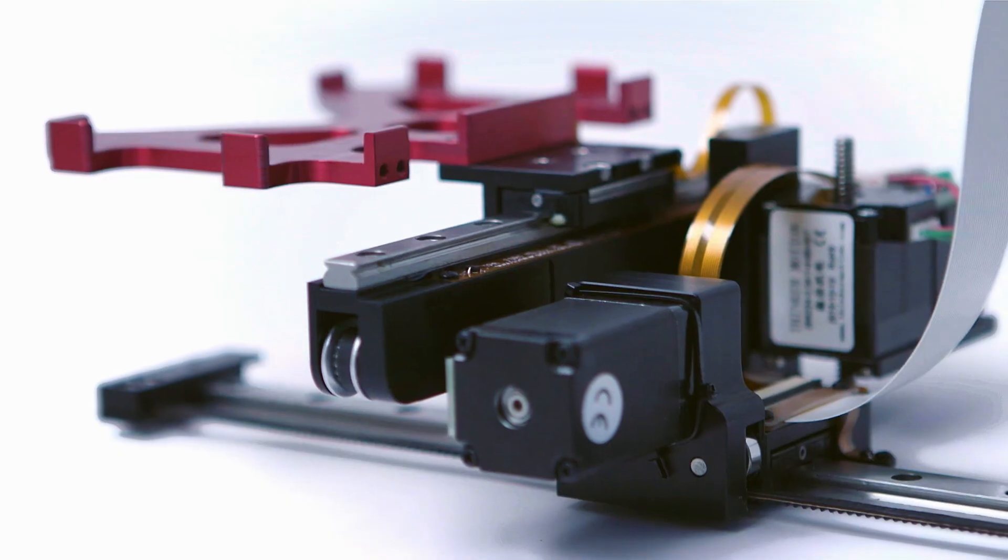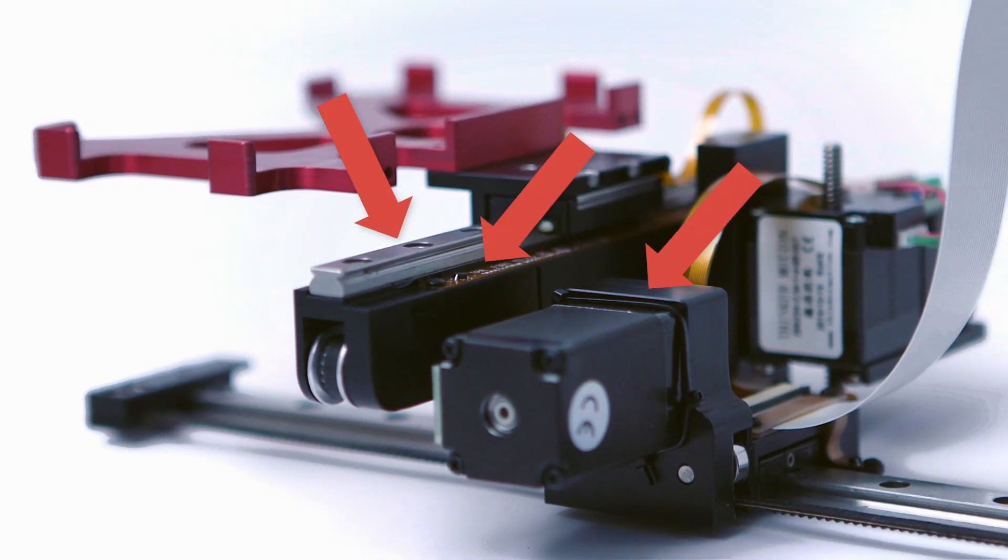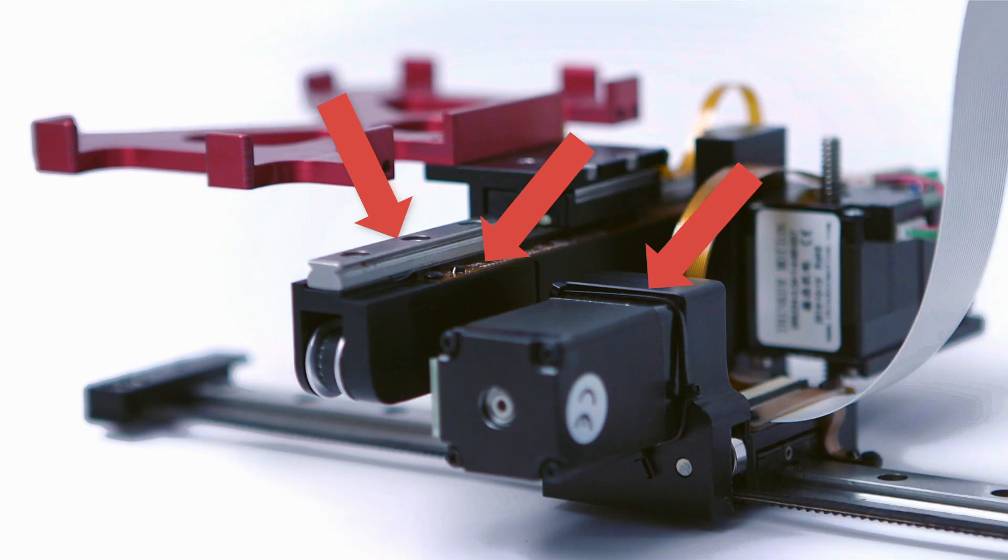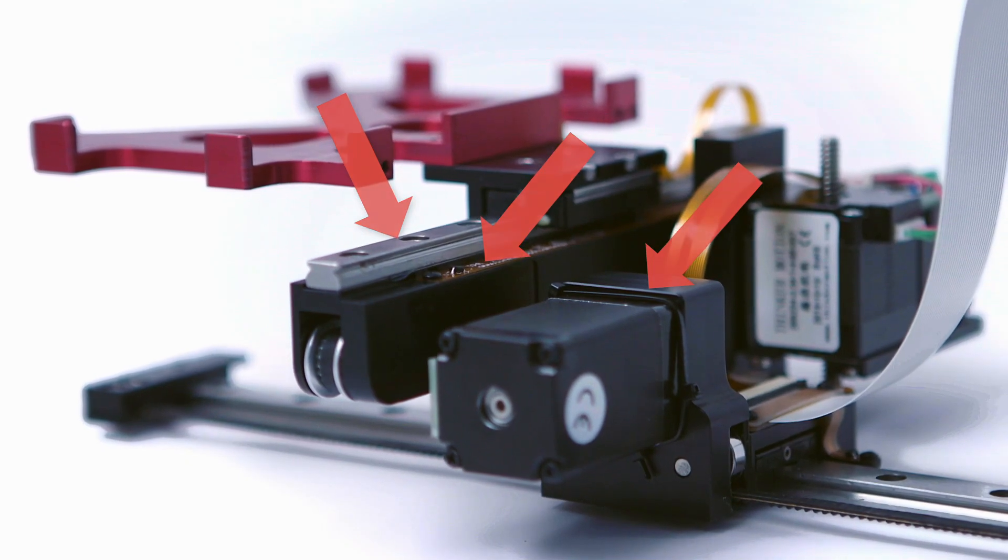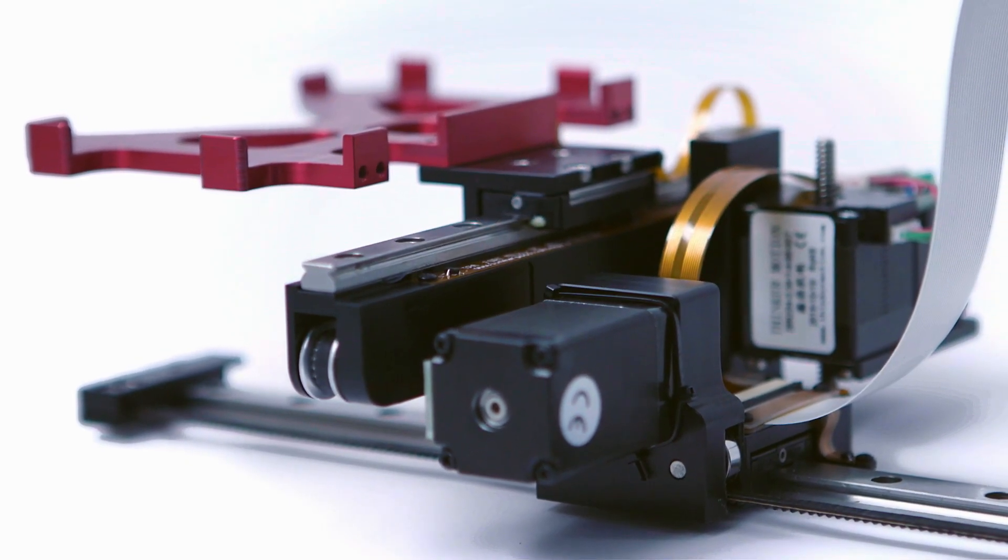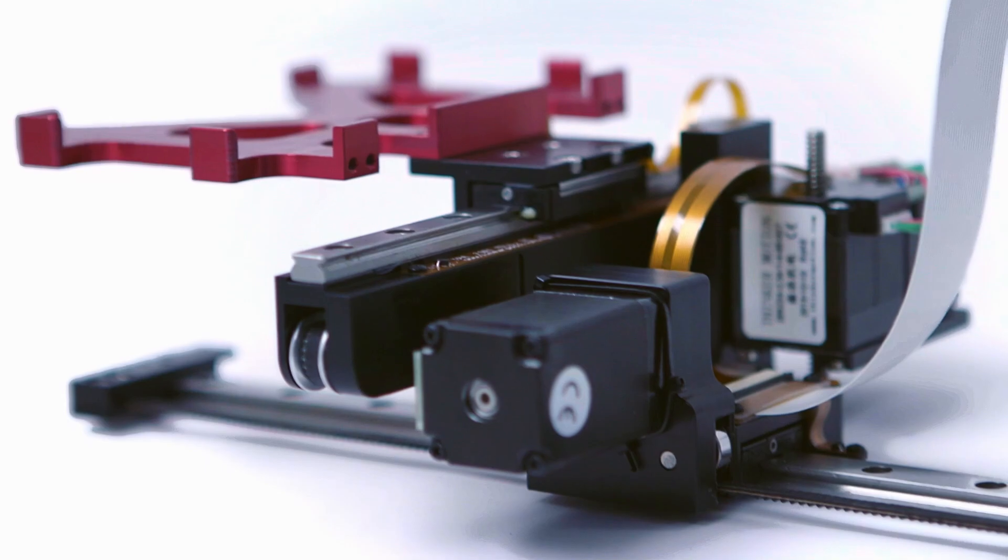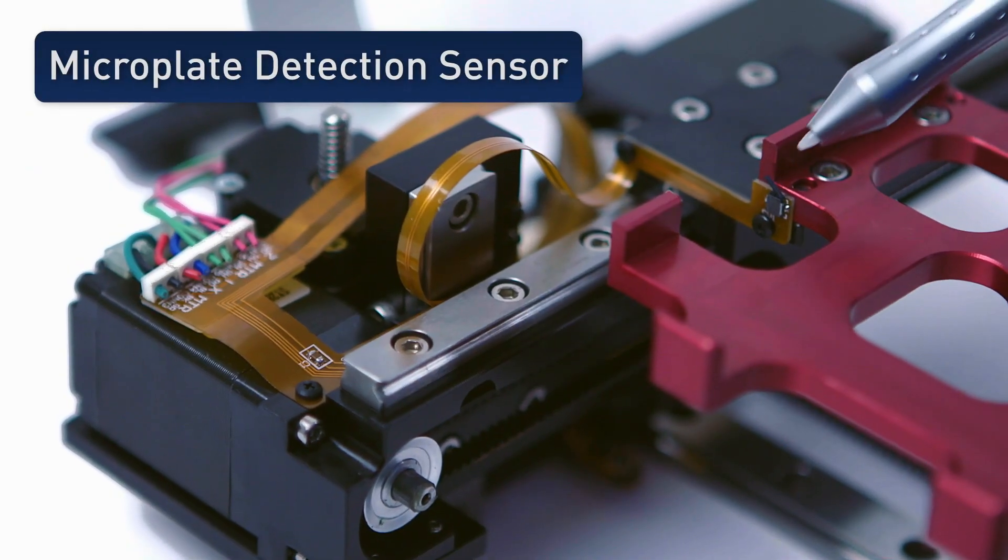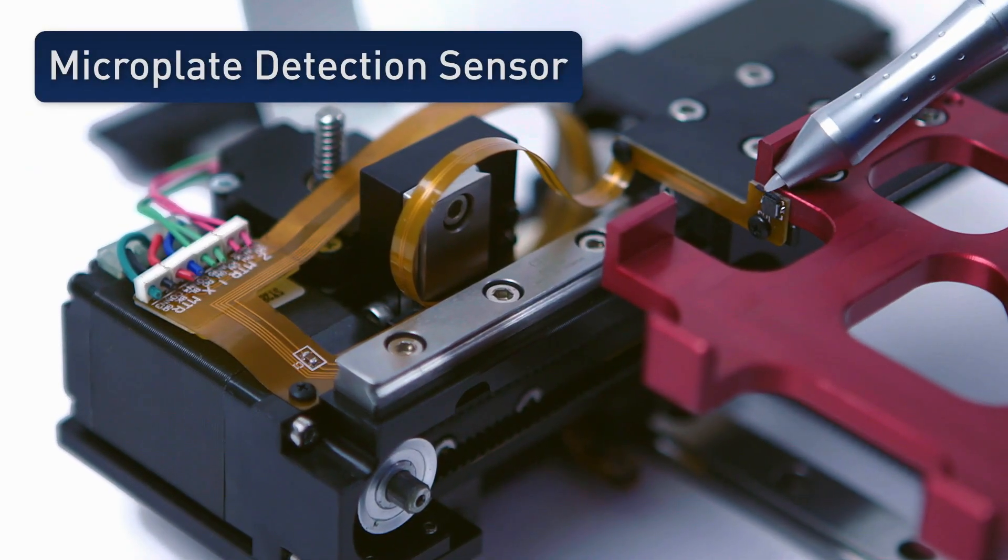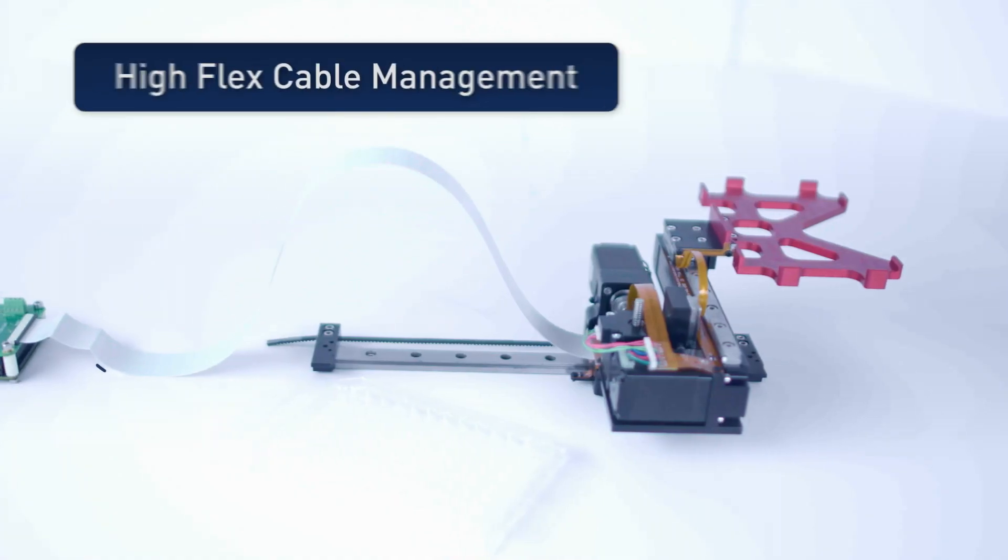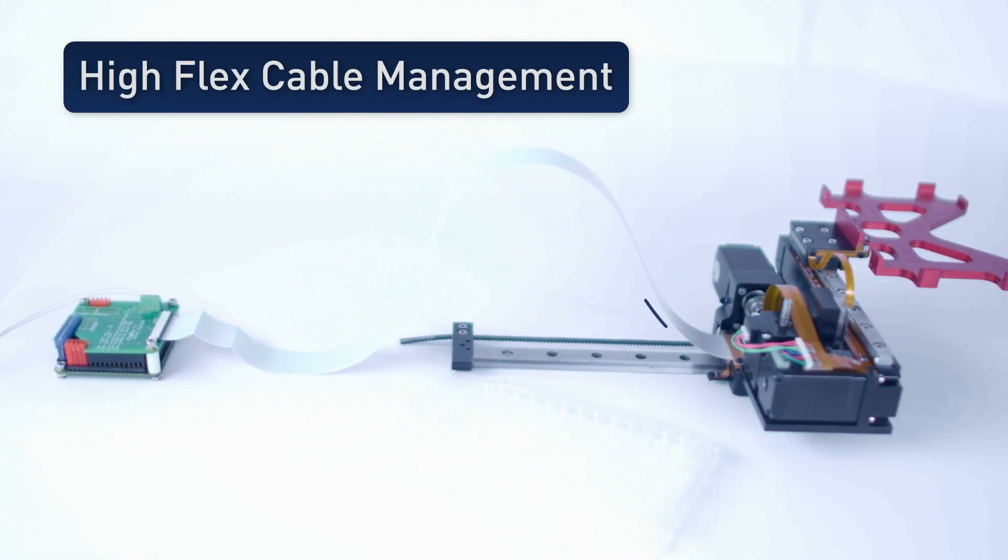It is an all-inclusive design with all the motors, bearings, and sensors necessary to form a basic XYZ robot, but also includes some additional features particularly useful for instrument applications such as plate detection, a docked position sensor, and compact high-flex cable management.